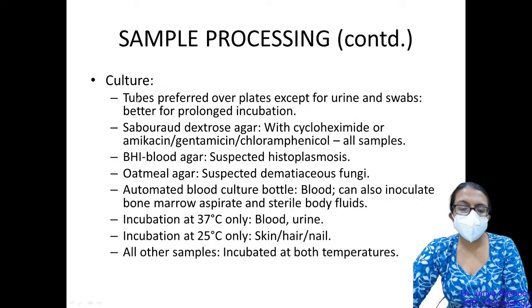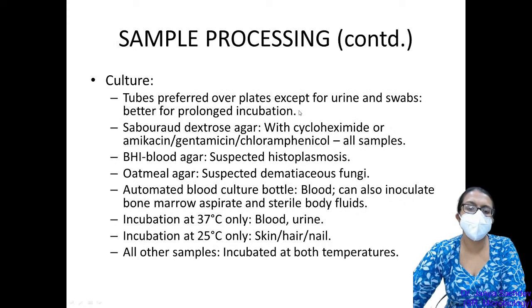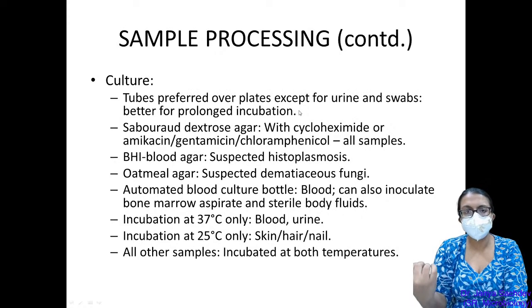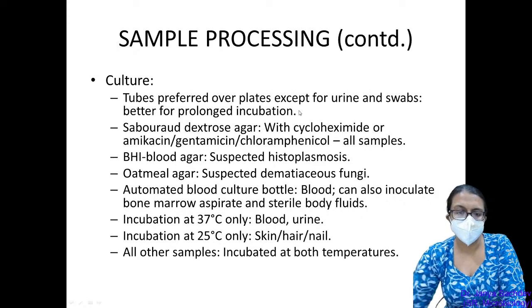So we prefer to put media into tubes rather than plates, which I'll be showing you in a few minutes, because it's better for prolonged incubation, for avoiding contamination, and for avoiding a hazard of infection to the person who's handling it every time they open the tube or the plate to check for growth. A tube has a narrow opening, less chance of risk to the person, less chance of contamination to the medium, and the medium won't dry out so quickly.